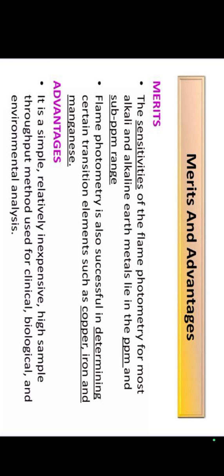Flame photometry is an emission spectroscopy. It is also known as flame emission spectroscopy. This is what we know about flame photometry.